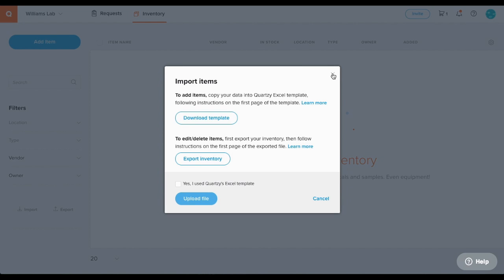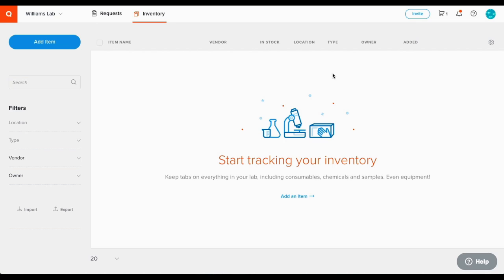Another option is to add items automatically when requests are marked as received in the requests module. This allows for dynamic updating of the inventory over time and is covered in our requests video.